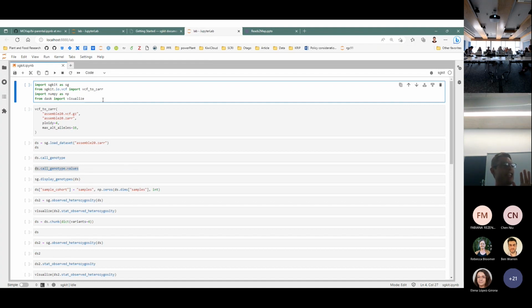I'm just aware that dealing with raw VCF like that is very difficult. It's not a nice way to deal with data. So I wanted to show another tool that I'm involved with, actually outside of the SCRI, but I'm hoping to have better linkage there in future. I'll try and present on it at the next major meeting, I think.